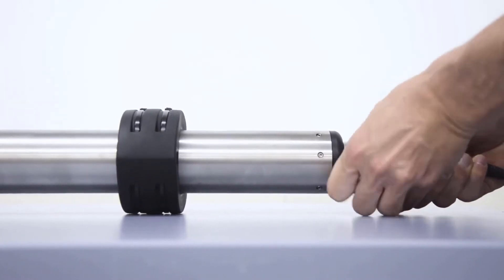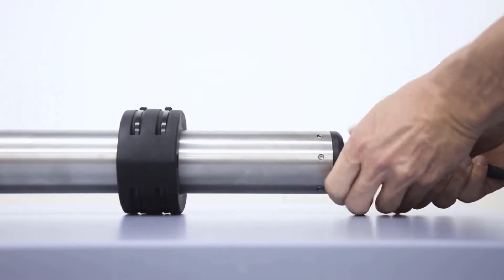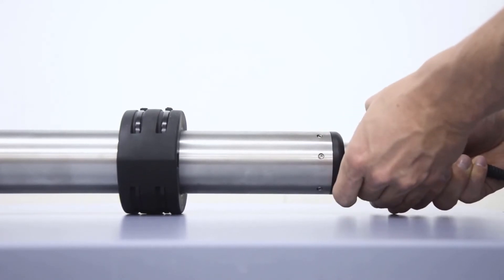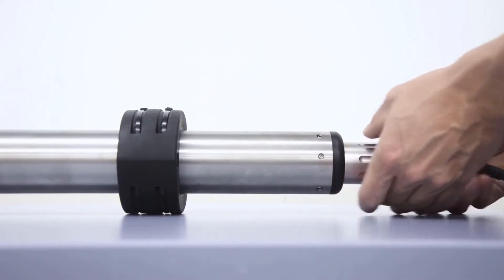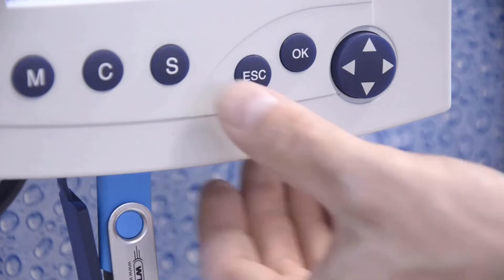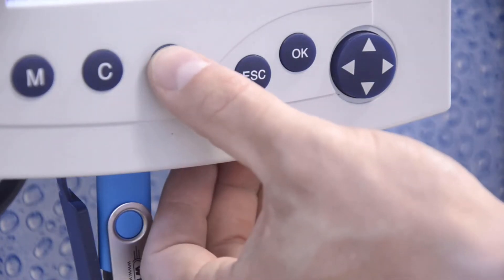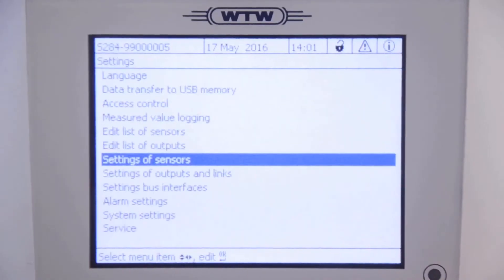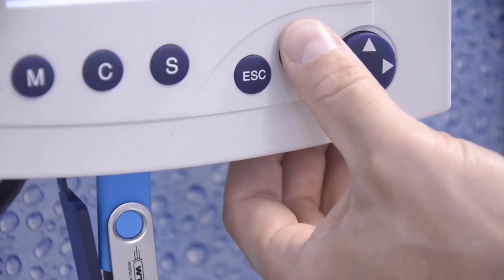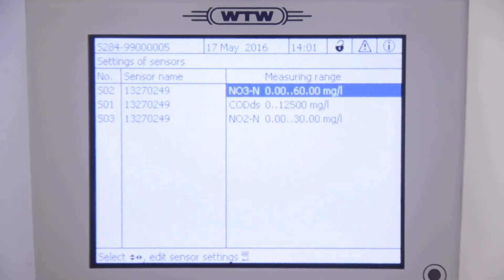On a NycaViz NI sensor, this will come up with three default measurements: nitrate, COD, and nitrite. To display two more carbon parameters, you must enter the settings for the primary sensor, in this case the nitrate sensor.